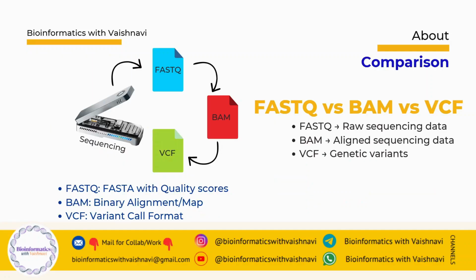Let's quickly recap. FASTQ, raw sequencing data; BAM, aligned data; VCF, genetic variants. If this flow is clear in your head, believe me, you are already ahead of many beginners.